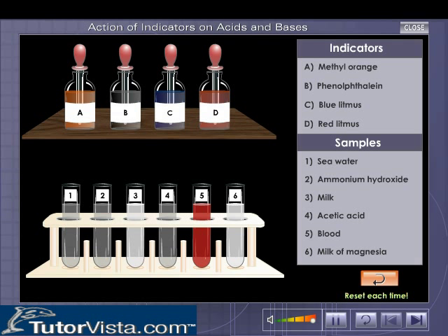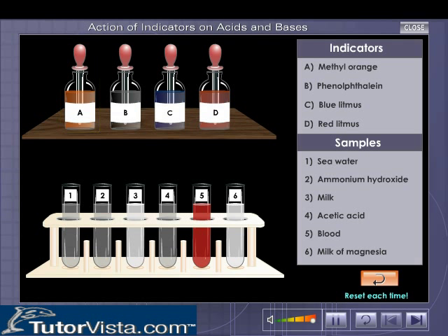To perform the tests yourself, follow these instructions carefully and do as instructed. Click on the dropper in bottle A containing methyl orange and drag it into test tube 1. Observe the change. The solution turns yellow.